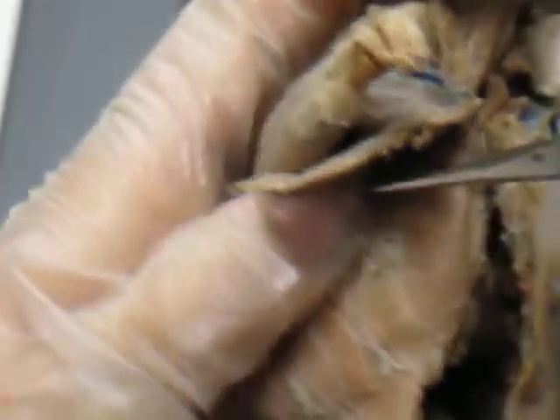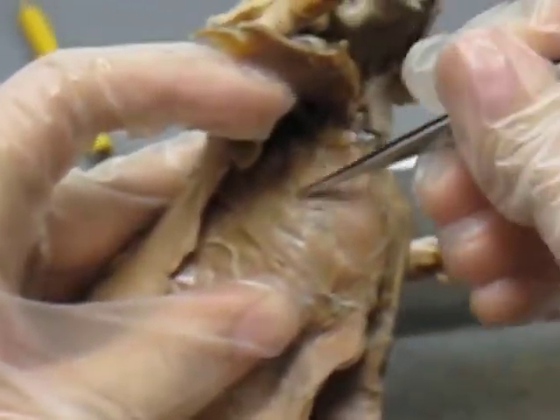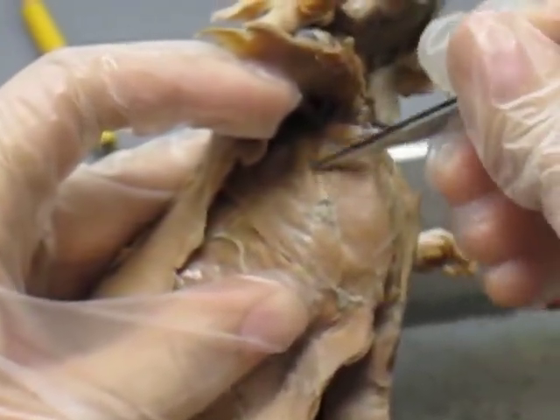And then if you lift this up, this muscle that's right next to your rectus abdominis, right here, is your scalinius, with a C.